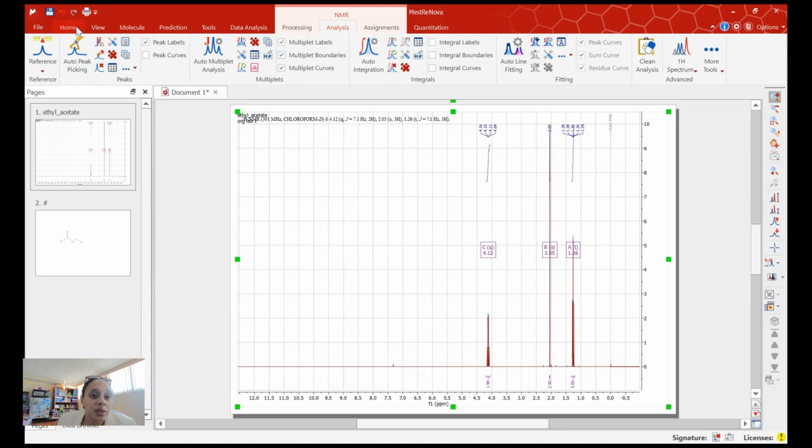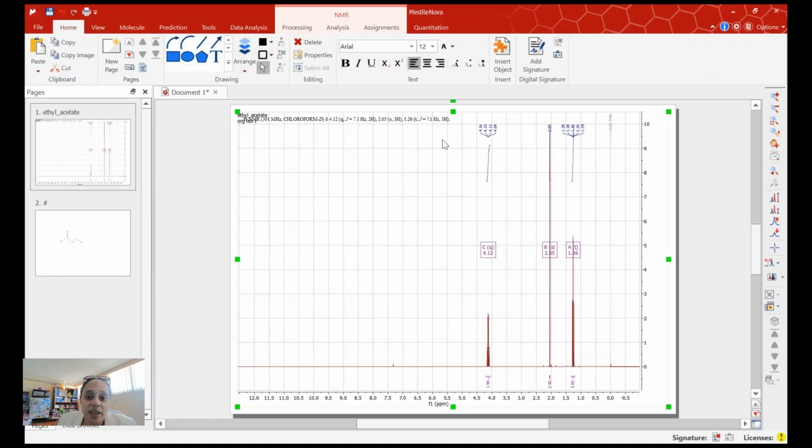So I could then just take this and copy this into my lab notebook. So copy, and then go to my lab notebook and paste that in. So remember in your previous examples, you had to manually write all of them in. Voila, you don't have to do that. You could just put your information in just like that.